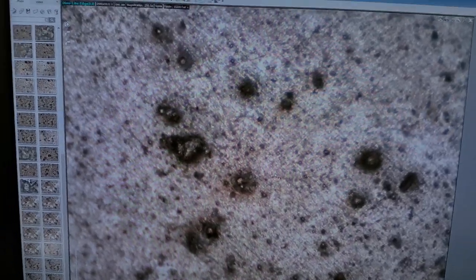Here we are looking around the sample. You can see there are some spheres on this sample, almost like metallic blobs. When we sent this to ME 356 for a look on his SEM, he said you want more of these.